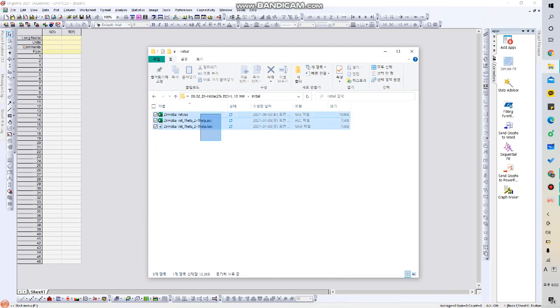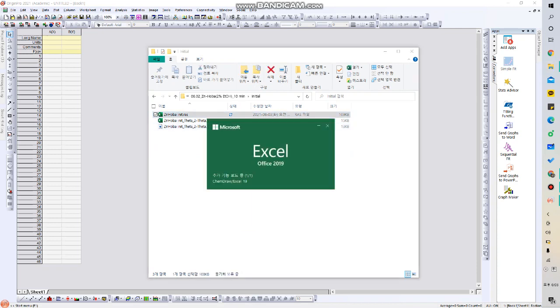As I told you earlier, 3 files are made: RAS, ASC, RAW. Using the ASCII file and transferring it into a text file is the most commonly used, but I didn't know that common fact. I knew it just today from Mrs. Choi. And this is how I kept my data.